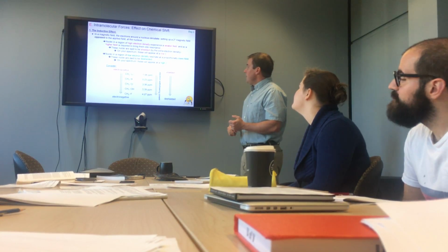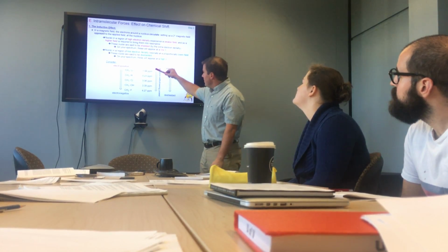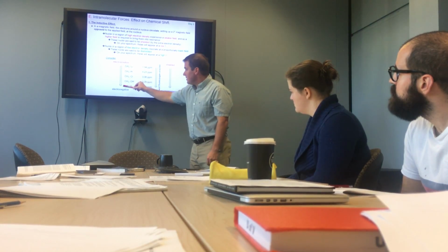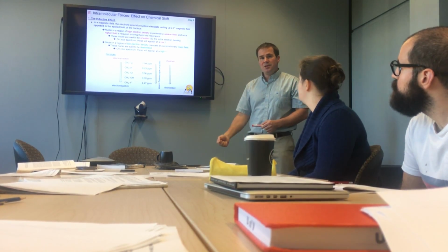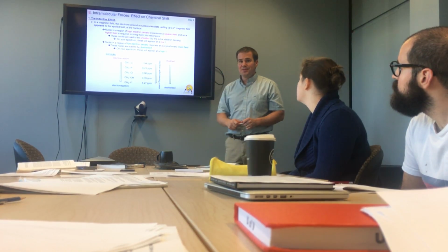What that means is that we get proportionately more and more de-shielded as we're pulling more electron density away from those protons. Pulling more electron density away, we are de-shielding the protons. We're moving to higher chemical shift numbers. It's cool, right?